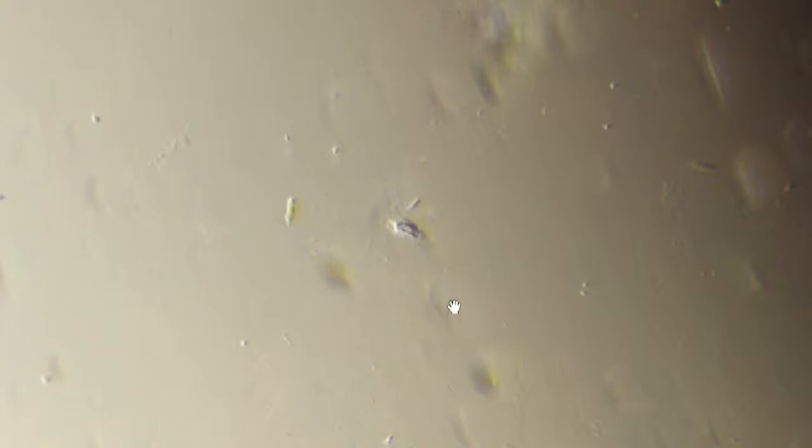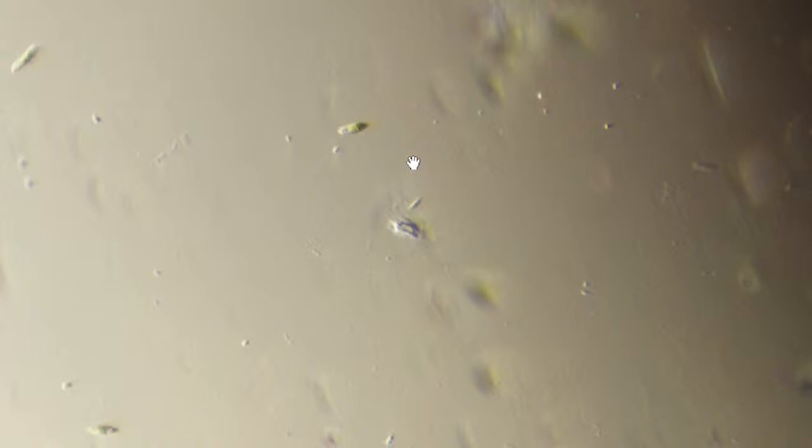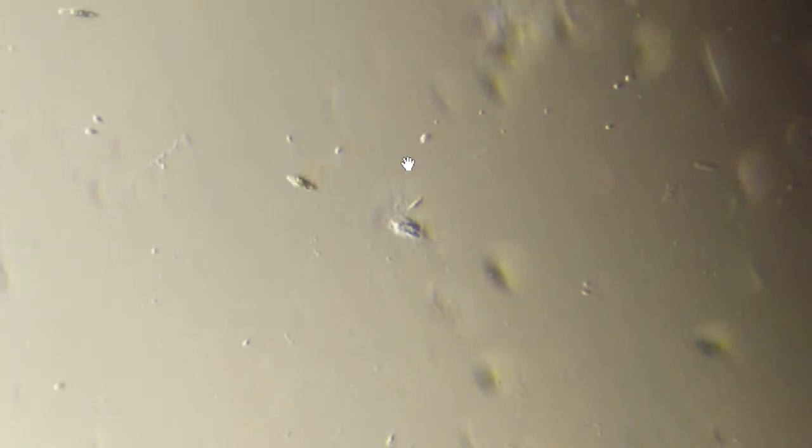Let's make sure I'm in the middle of the frame so I'm not confused with what I see versus the camera. And let's... There's a Euglena right there, a Euglena right there. I might have put a little too much water on the slide so they've got a little extra leeway. Let's try dark field for a bit so you get some colors and some contrast. There's a whole bunch of Euglena there.